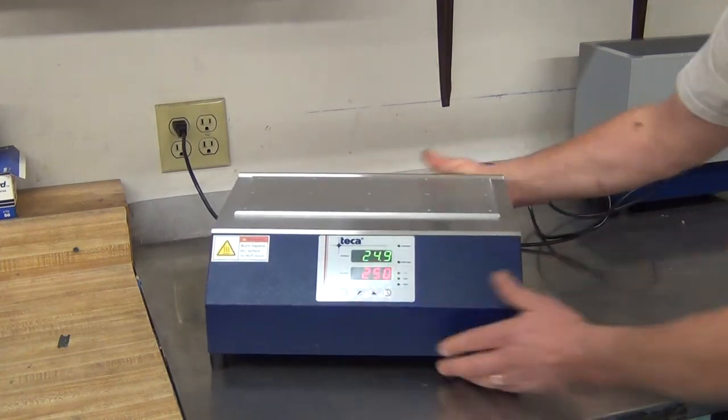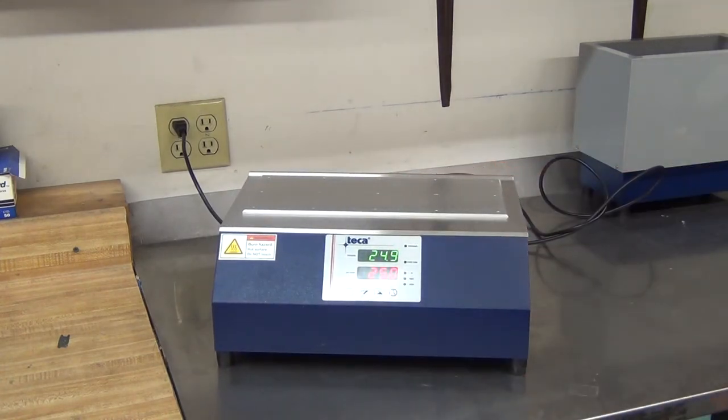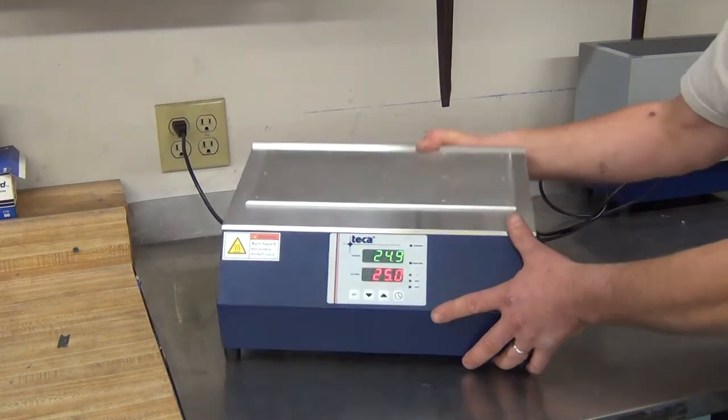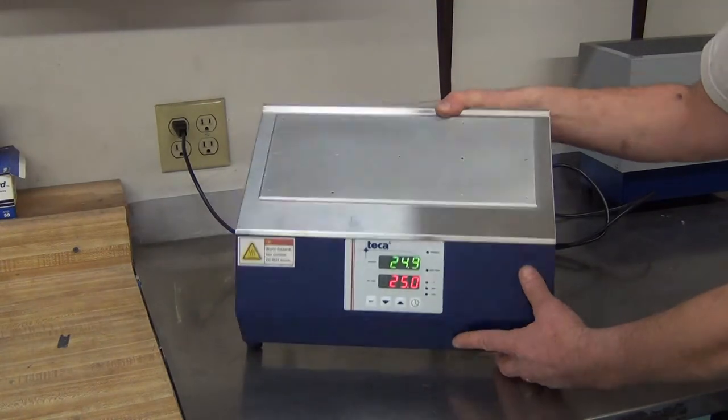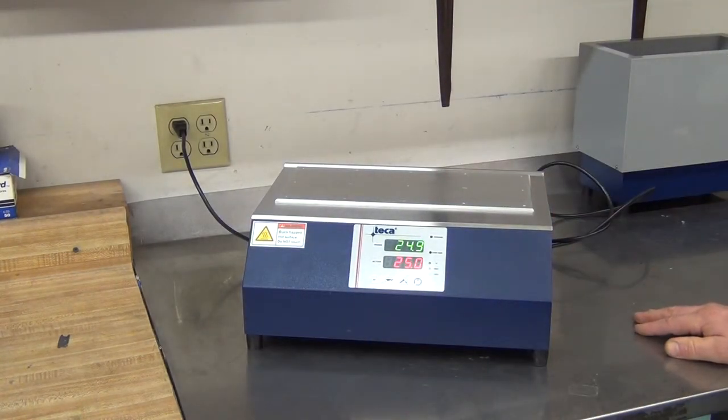And here you have a version that's been around the world more times than my boss has. This is a tapped version, the loaner unit from Tekka, running right now and controlling that 25C.